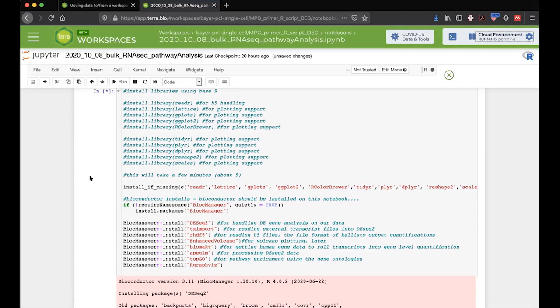That's a good question, though. I've been thinking that I kind of want to get into that, and I just don't feel familiar enough with saving off my own custom images that I've done it yet. But I'm thinking that might be the next step for me. But once you have them saved to a workspace, it keeps it in that cloud environment.